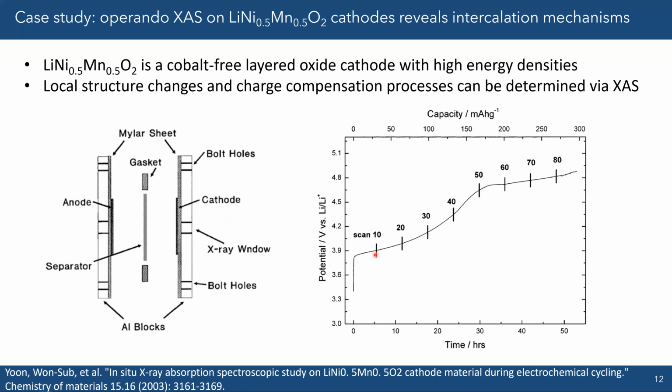So they called it in situ. Yeah, they called it in situ, because I feel like in literature, in situ and operando are pretty much mixed up a lot. Like we took Raphael's class where she really stressed what operando versus in situ was, but I found that in literature they don't abide by those rules as much. So this should be operando.